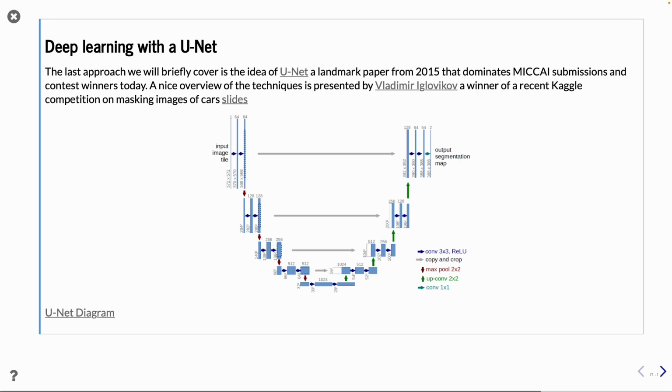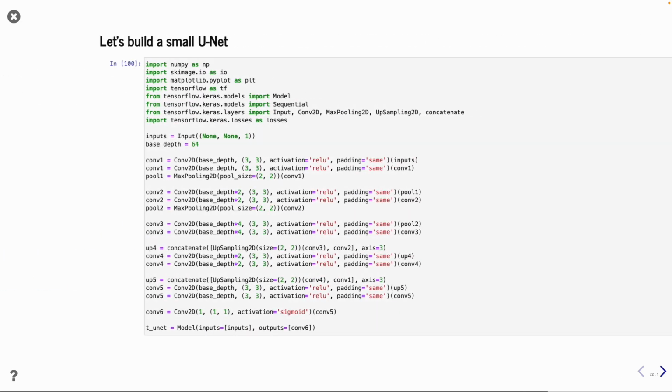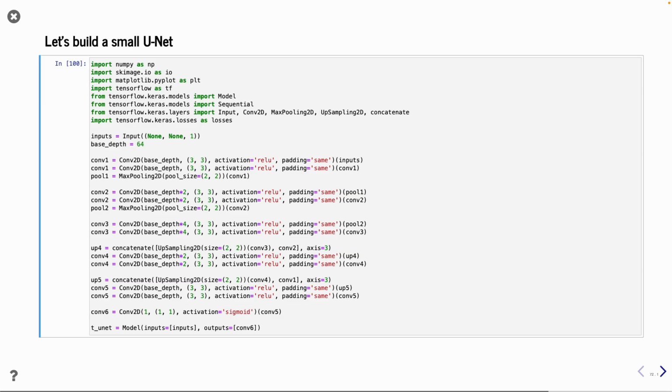If you want to learn more about it, I recommend you go to the literature, maybe even take a machine learning course where you learn it in detail. I just want to give you a little glimpse of what these look like and what they are about. The important thing is that they are not so difficult to implement. There are packages. In this case, I'm using TensorFlow combined with Keras. There is also PyTorch, which is another Python package for deep learning.